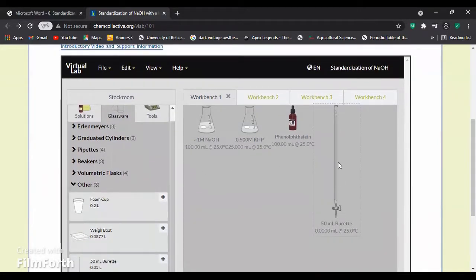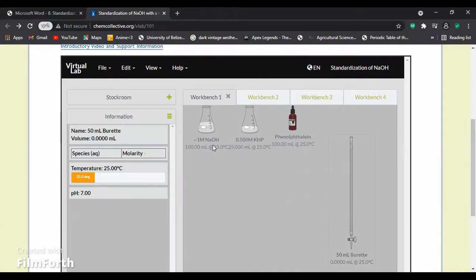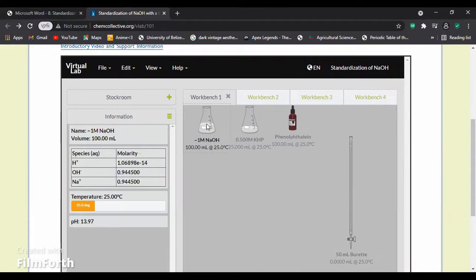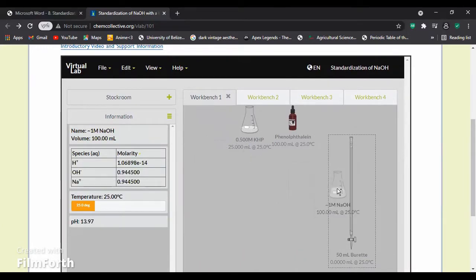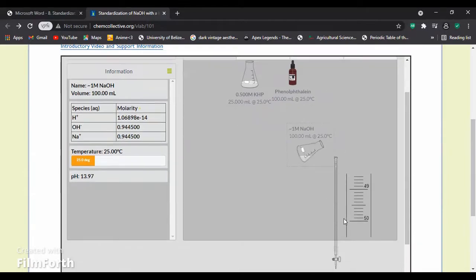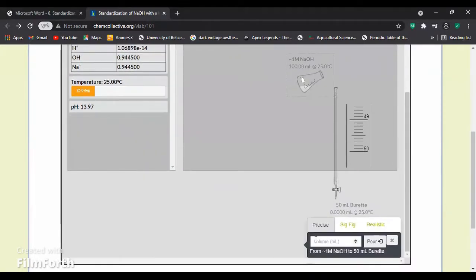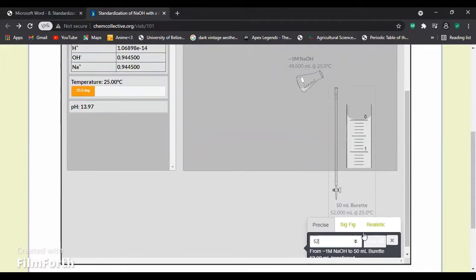Having all our materials, we can now proceed to add the NaOH into the 50 milliliters buret. We will add 52 milliliters so that it can reach zero.